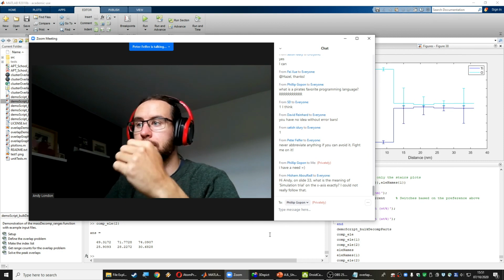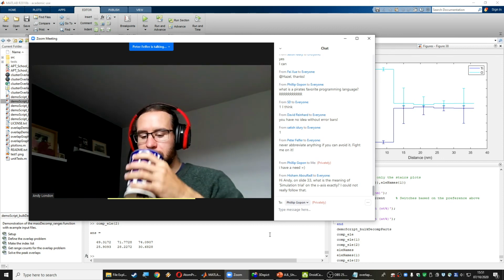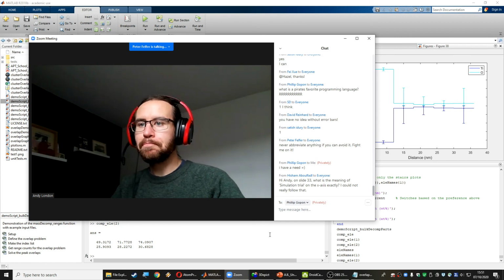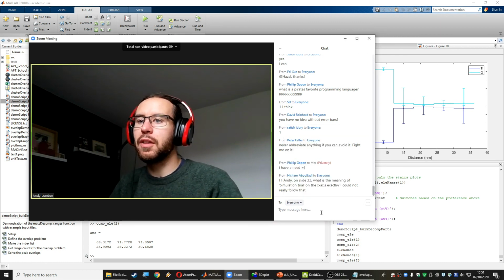And maybe you'll see when we show how we do 1D, 2D concentration profiles and the like, that once you have that kind of a little program, you can plug it into all of those different methods, and that would really be helpful for a lot of things. Yeah, that'd be great. Yeah, totally up for that.